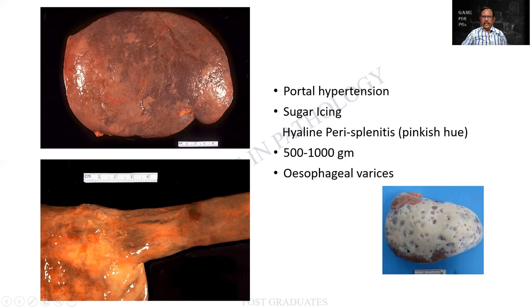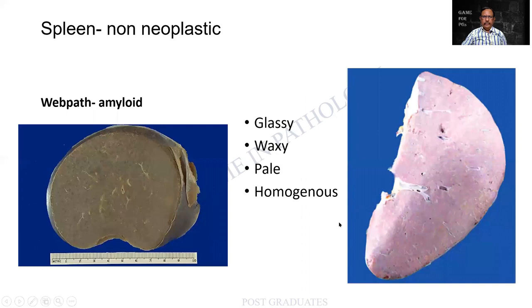And this again is a classical example of the sugar icing that I had mentioned earlier. There is a pinkish hue and an adhesion that can be seen.